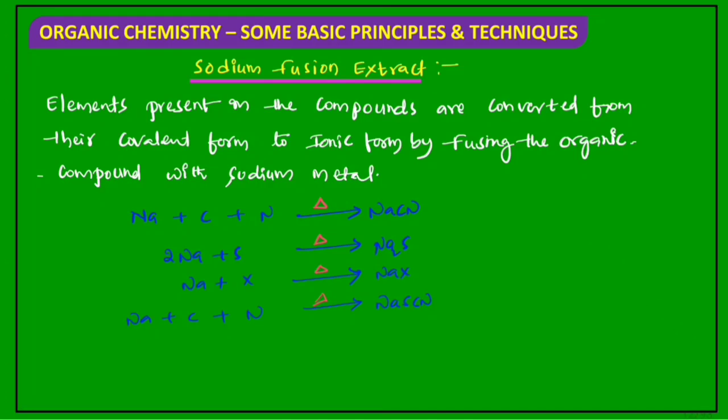Before that, sodium fusion extract. What is sodium fusion extract? The elements present in organic compounds are converted from their covalent form to ionic form by fusing the organic compound with sodium metal.